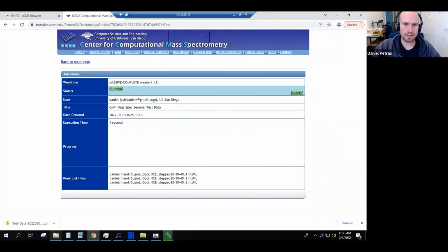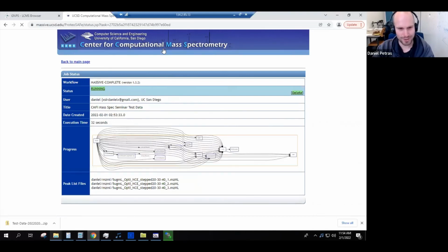One important thing is that creating a data set will first keep this in the private space. So once this data set is ready, there will be a particular button you have to click in order to make your data public. Some people, especially when they upload this for a publication, often forget to make the data public. So until you click that button, it remains private.